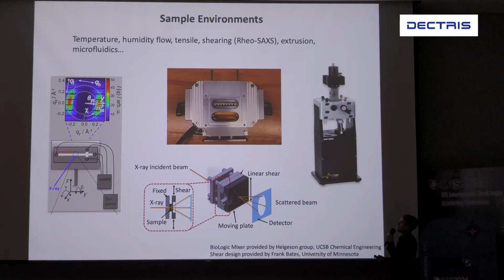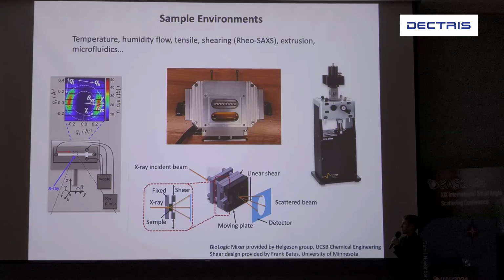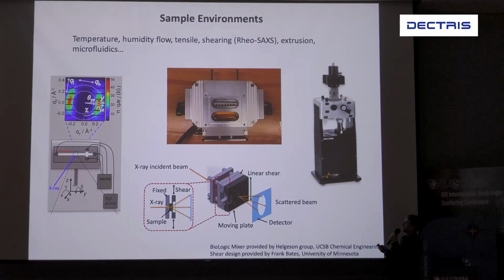Lastly, we have a variety of sample environments. Yuli is an amazing engineer, and if you ever need a specialty type of experiment, we are more than willing to help you. These are some things that we have. We have flow cell capabilities, a temperature cell that currently can go to 250, but if we need to, we can make it go higher. We have shear, as well as microfluidic devices available.